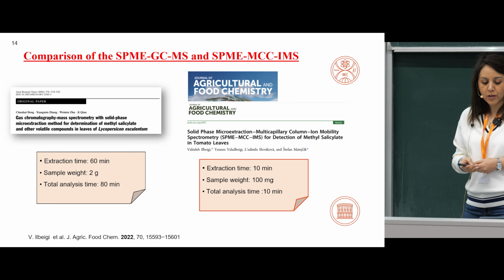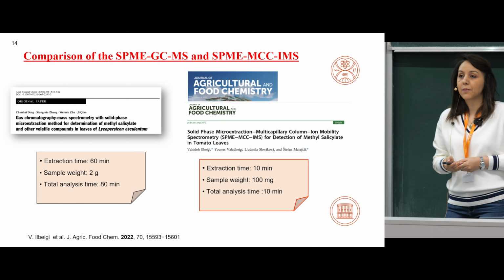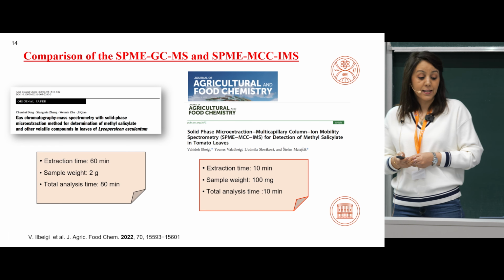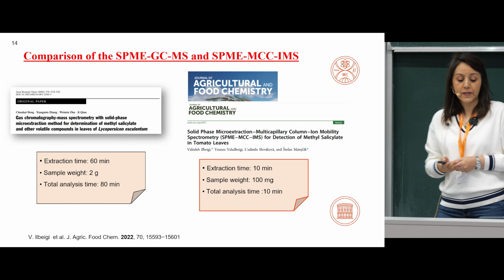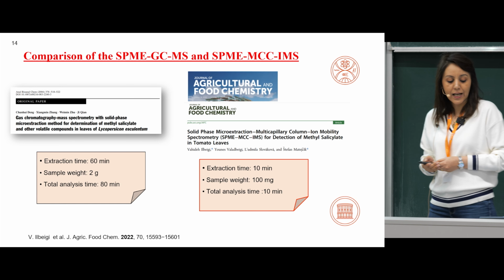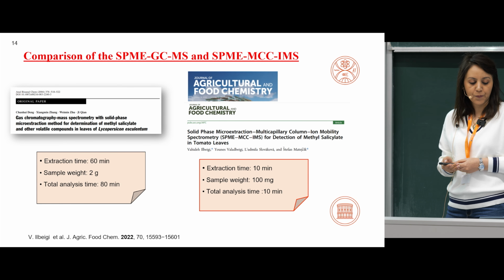This work is already published, and our results show that the SPME-MCC-IMS method is fast and sensitive compared to SPME-GCMS, and we need less sample weight, and total analysis time is also shorter than the GCMS method.